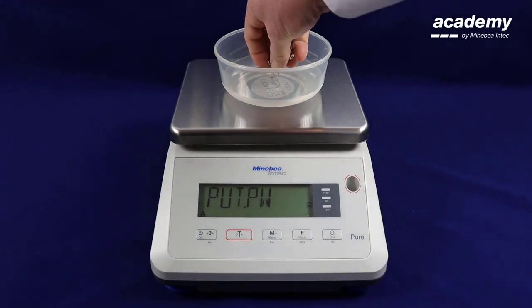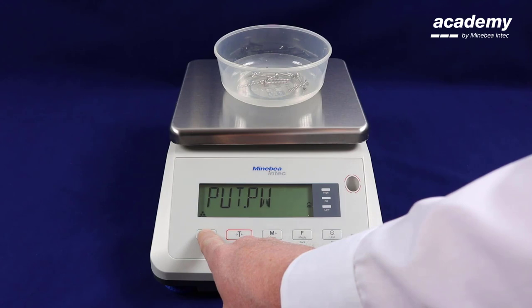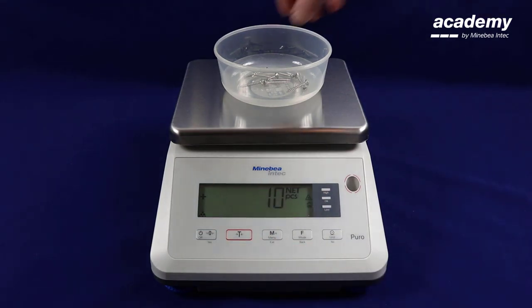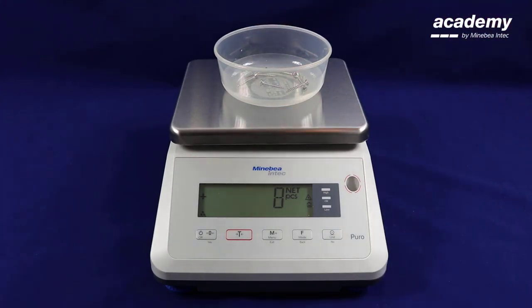Place your ten new piece weights into the container. When all ten are in the container, press yes to accept. It is now showing piece weight is okay. Once again, this is displaying the counting application.